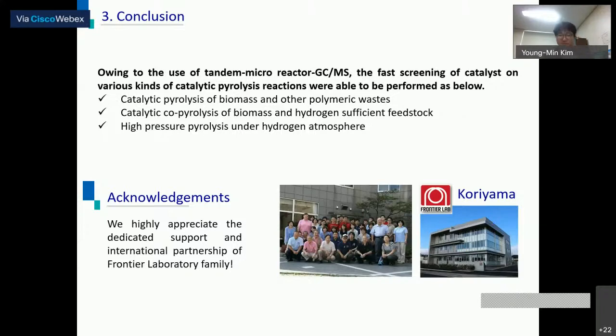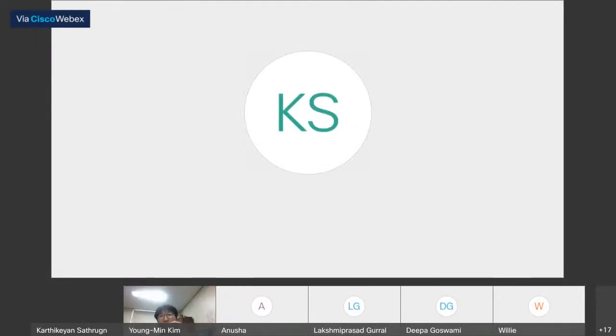Okay, thank you, Dr. Kim-san. I really appreciate this nice presentation. At least we have got some good take-home messages. I would say catalytic pyrolysis can reduce the char, also give some value-added products, and the synergistic effect with plastic and biomass can give better yield. And again, you can also consider high pressure reaction for reducing the char. That's also some interesting information. Okay, so I will try to go through the questions that have been put in here. And afterwards, if there are any more questions, please feel free to add them.